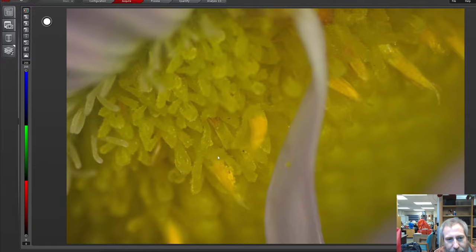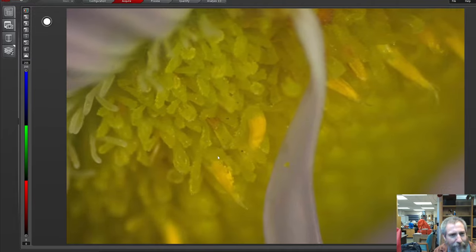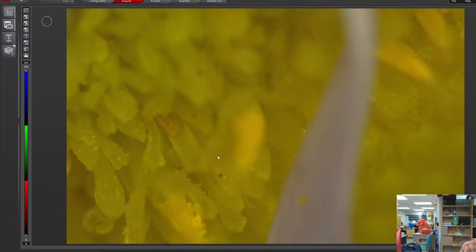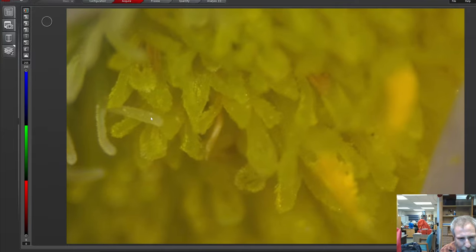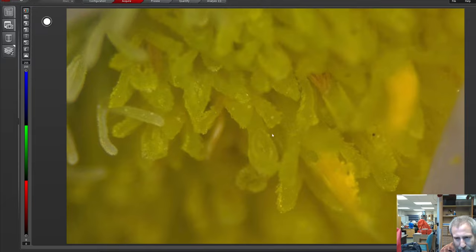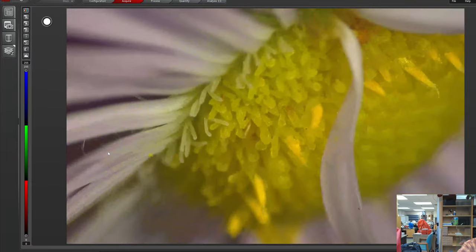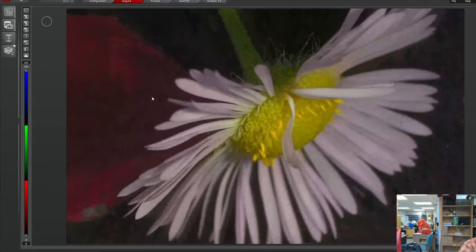I think you can see that sort of yellow furry components. And again, I think those little specks you can see on them, the little bright yellow areas, are probably actually pollen grains. Yeah, so there's some really light, bright colors in here. I think those are the actual pollen grains. There's one. There's not a lot, but there's some in here, just sort of covering over the actual anthers. And these ones have a white-colored structure around the edge that's a little bit different than the yellowy stuff in here. And the actual petals are a very light pinky purple.